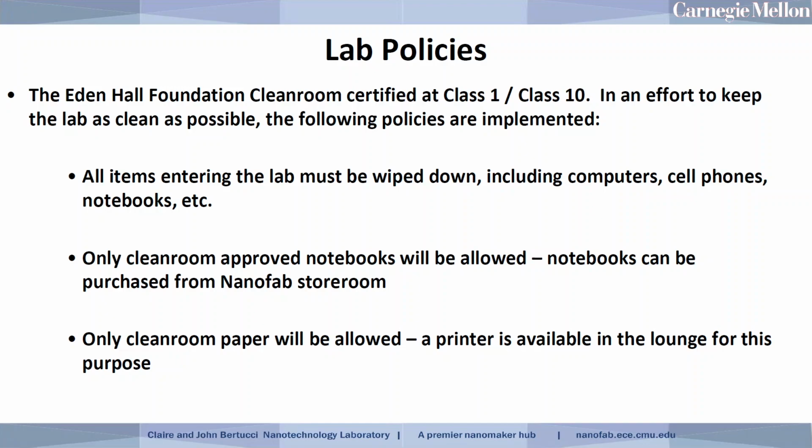So these notebooks, we stock them in the storeroom, so you're welcome to buy them from us. You're welcome to source them externally. We also have loose leaf clean room paper available for note taking. And that paper is located in the printer in the lounge area of the lab. Okay.